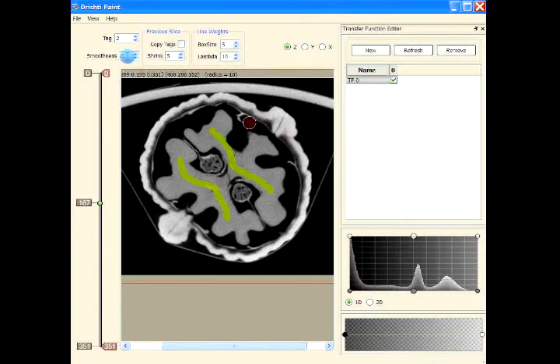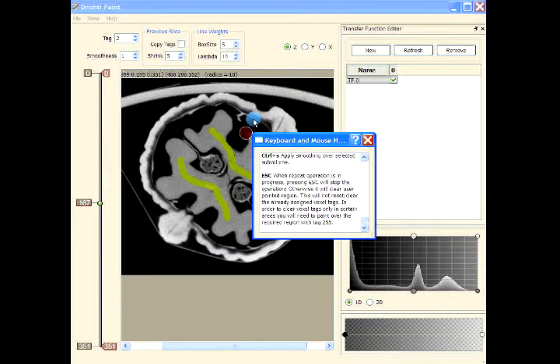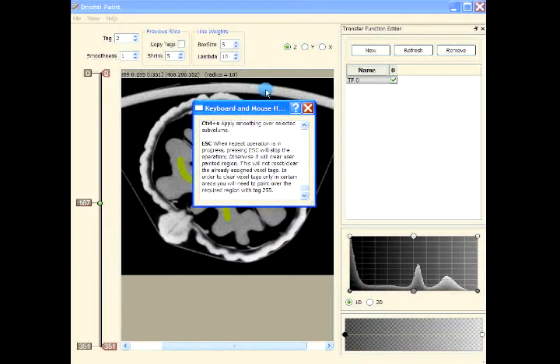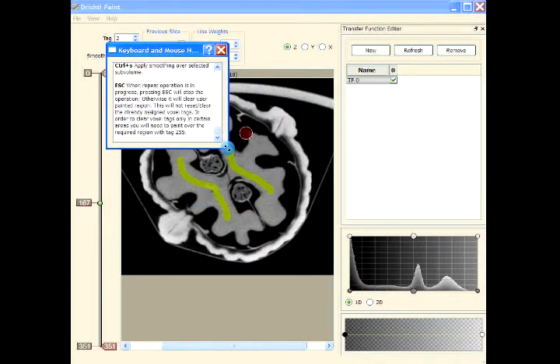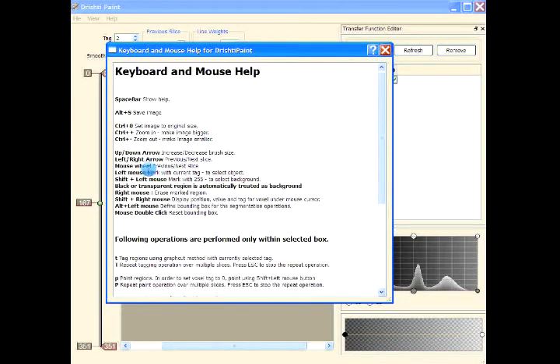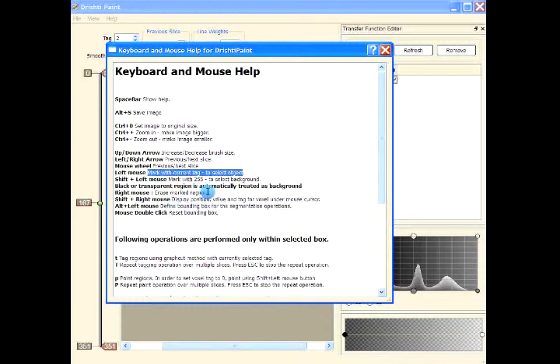This help is available — you can press the spacebar or go to Help and press the help key. Left mouse button dragging marks the region with the current tag, and right mouse button erases the marked region.